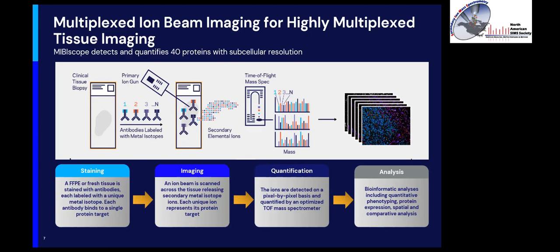We capture those reporter ions that we attached to the antibodies that we stained with. And each unique ion represents its protein target in the sample. We can quantify what is there. The ions are detected on a pixel by pixel basis.